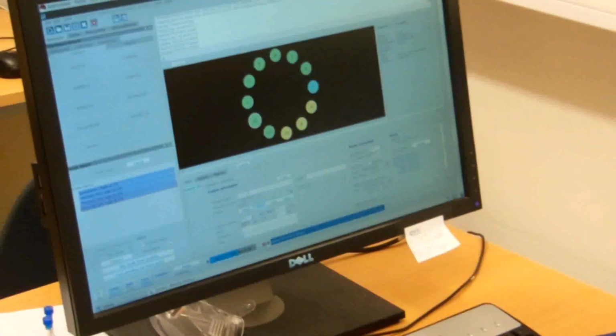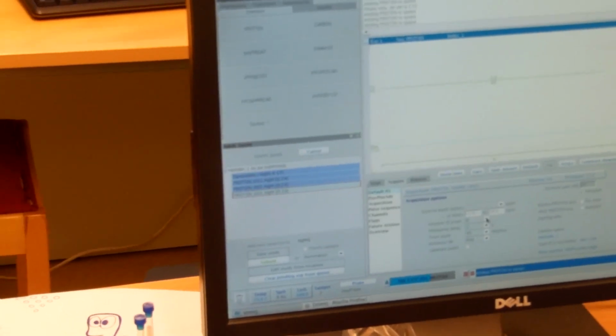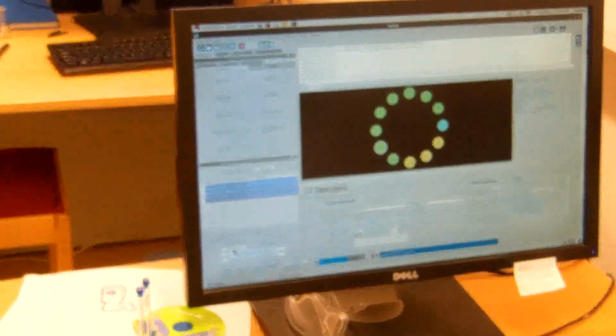Now you put in the information, the sample name, for example, Hisham, and it is number 1. Then you double click here to get the number of scans. You choose the number of scans according to the concentration. So if you have 5 milligram, then it is enough to have 16 scans, then save. And it is already clicked here, number 12. Then everything is fine, and you just say submit.